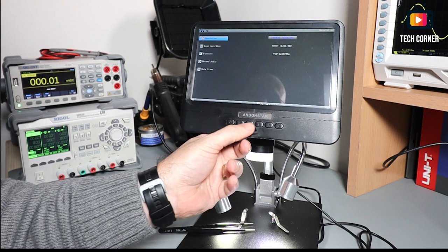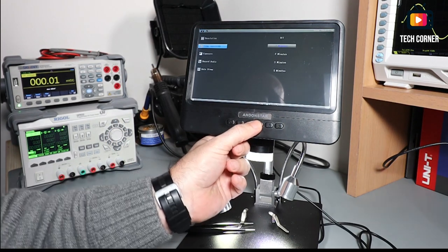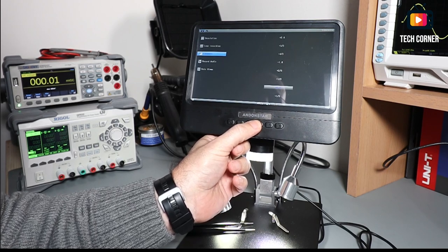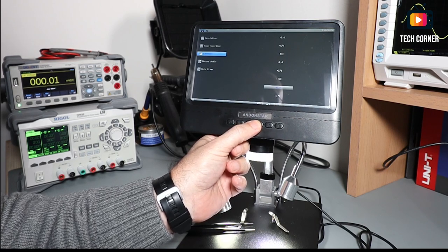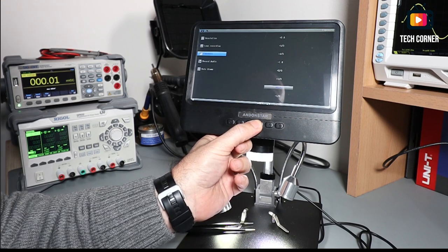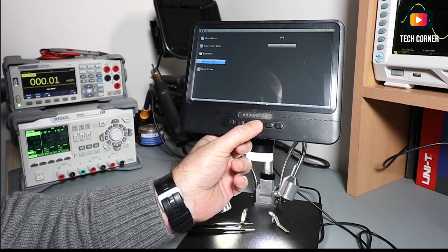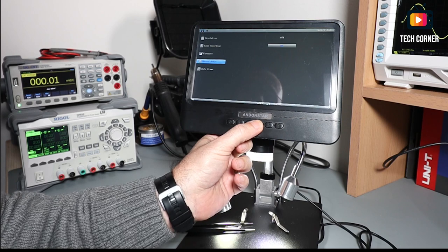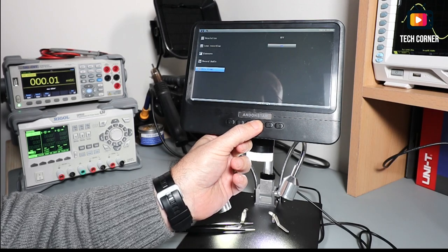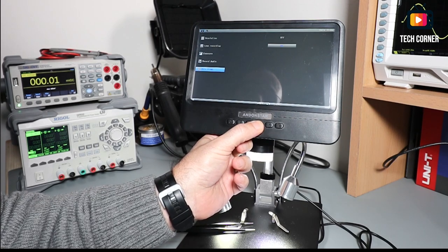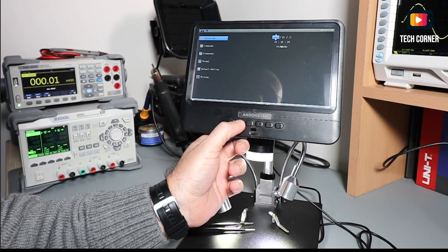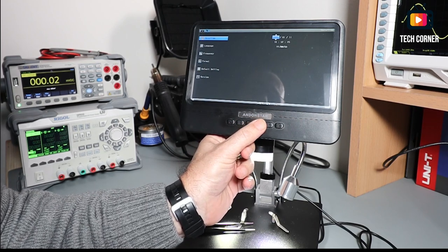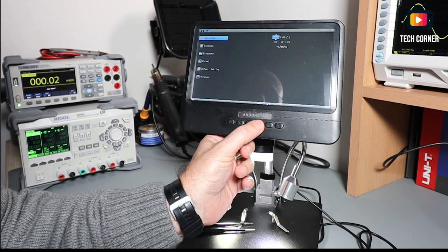We have also the loop recording, the exposure we can set up, if we record the audio or not, if we put the date stamp in the recordings, and we have also to fix the date and time.